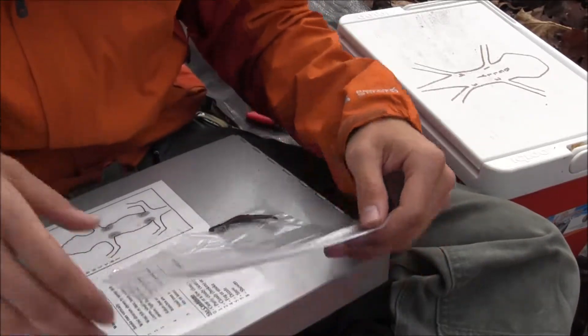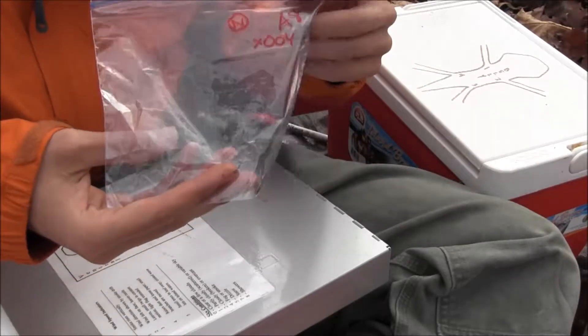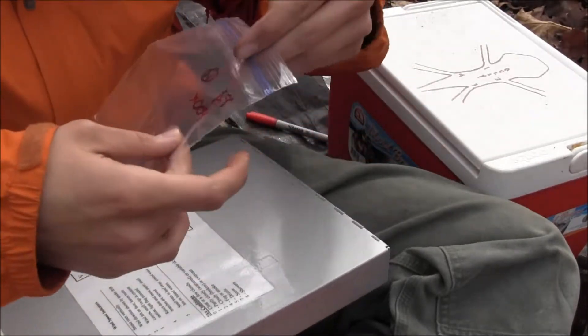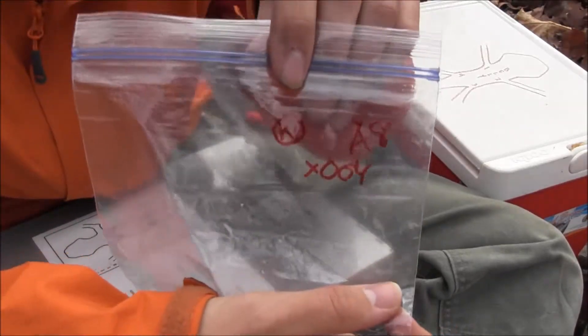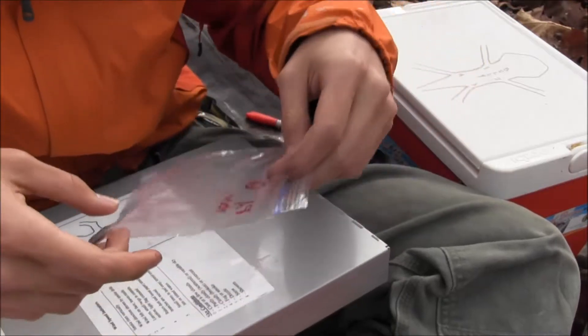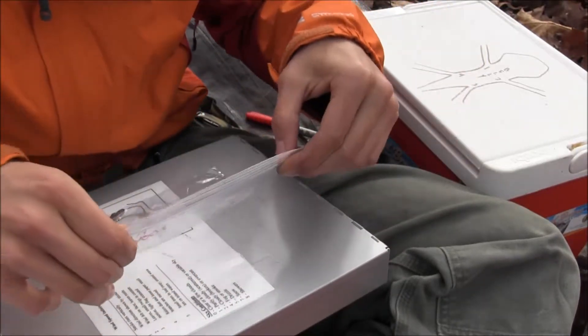Nonetheless, when we're out here in the field, we keep them in a cooler to keep their metabolism low and reduce their stress. And already, I've assigned this individual the code X-O-O-Y. This is coming from our master code sheet for this plot.